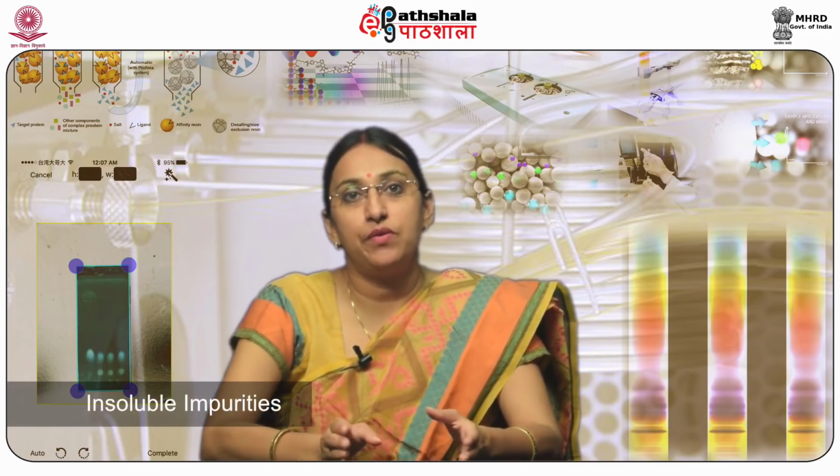Also, the requirement of removal of insoluble impurities by filtration, centrifugation, dilution or concentration to control the concentration and extraction of the liquid or the solid phase, derivatization for detection, etc. should be thoroughly checked. For best mobile phase and columns for HPLC method development to be selected, the sample solubility should be determined as to whether the sample is soluble in organic or the aqueous solvent.